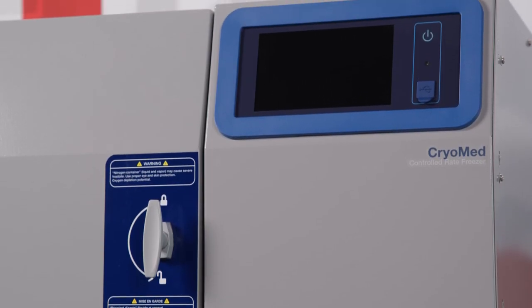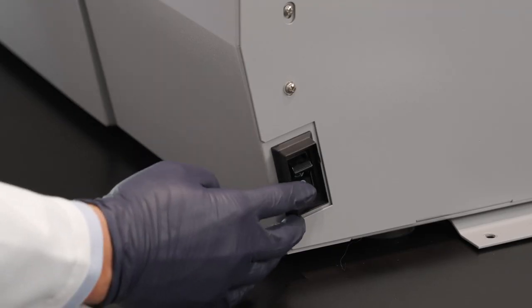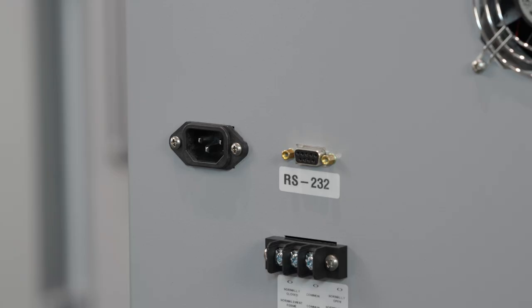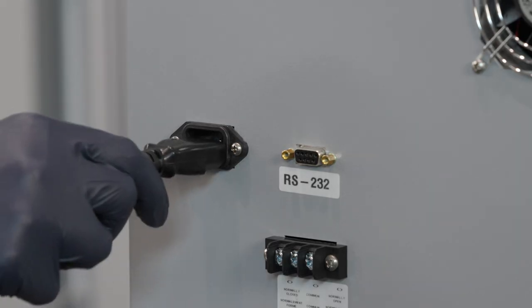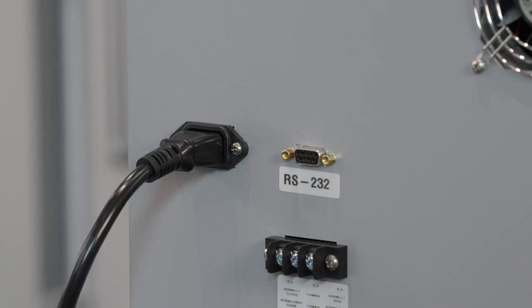To power up your unit, you must first establish the electrical connections. First, verify the on/off switch on the right side of the unit is in the off position. Second, connect the appropriate line cord to the power inlet on the back of the unit. Last, connect the unit to a grounded, dedicated circuit.